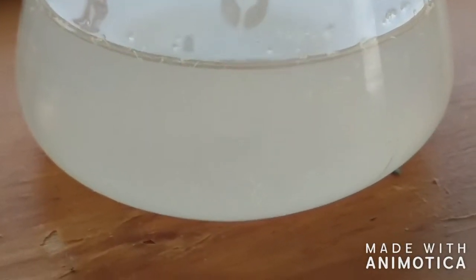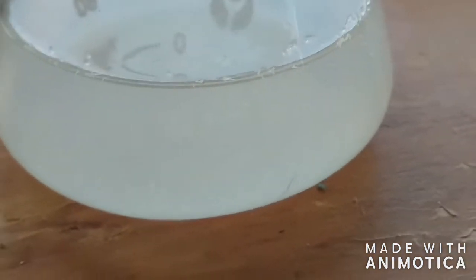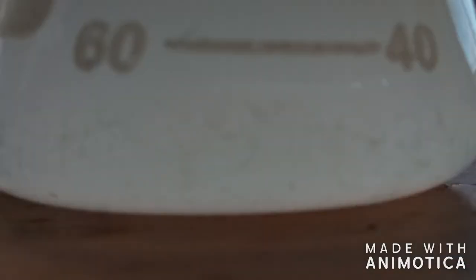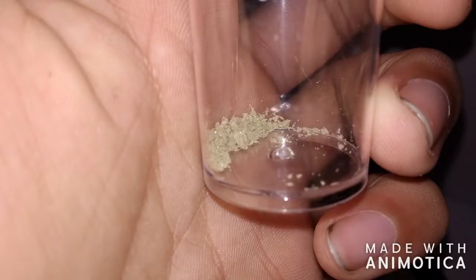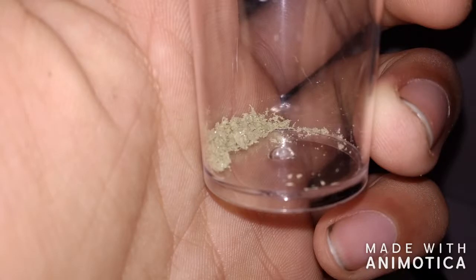I would have recorded a time lapse, but my camera couldn't see the small crystals forming, so I had to take photos instead. We can see that the sulfur crystals collected are a little dark, so it's not exactly pure. It's not too much sulfur, but it's just enough to prove the concept. I could recrystallize it to get better purity, but the amount of sulfur is tiny and recrystallizing would take too much effort.